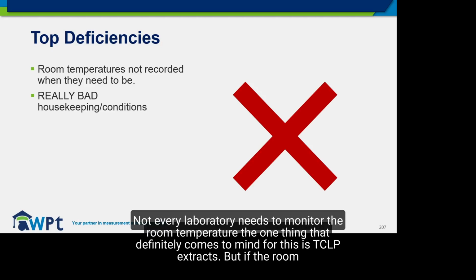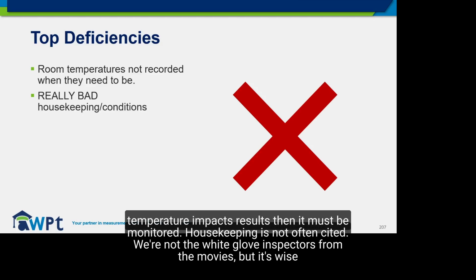Not every laboratory needs to monitor the room temperature. The one thing that definitely comes to mind for this is TCLP extracts. But if the room temperature impacts your results, then it must be monitored.